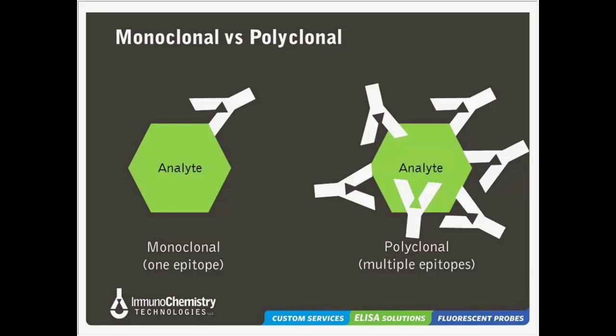The downside, of course, is you can lose everything if you don't keep your tank filled up, or in some cases, you don't really have a mono. You have a diclonal, in which case you might have another cell in there that's out-competing the good guys. So there are some downsides to the monoclonal.